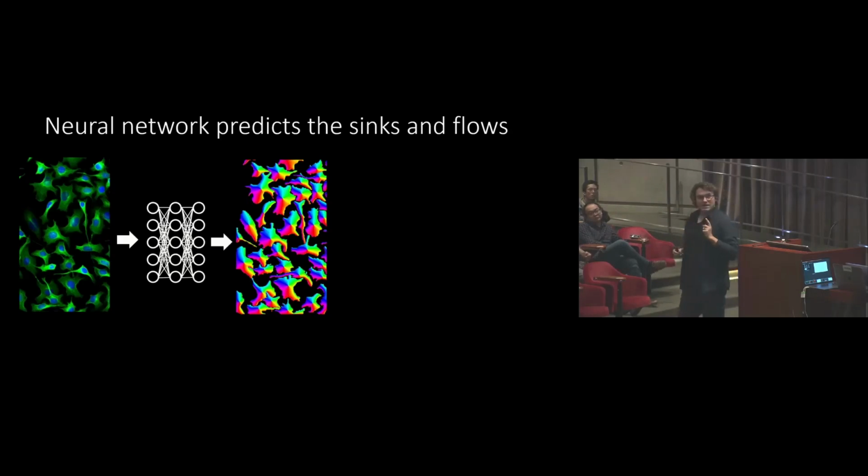All right, so that's the secret juice that made the algorithm work: to come up with a representation of this sort that would work on cells of various shapes. So even if you're out here in these kinds of dendrites, you don't point straight towards the middle of the cell, because that would take you outside the cell. You point first towards some intermediate path that gets you to the center of the cell. And so that's the representation that we now ask a neural network to predict for us.